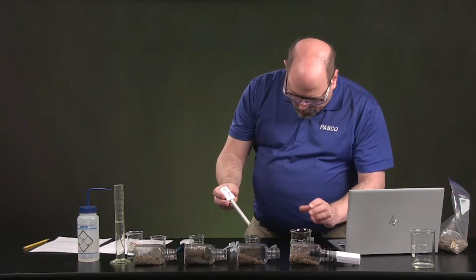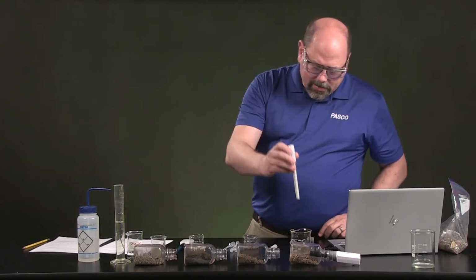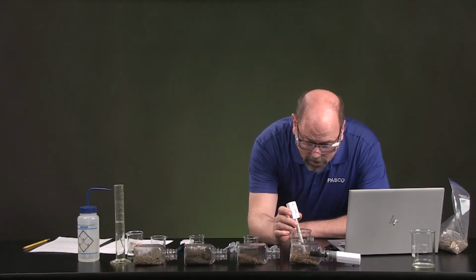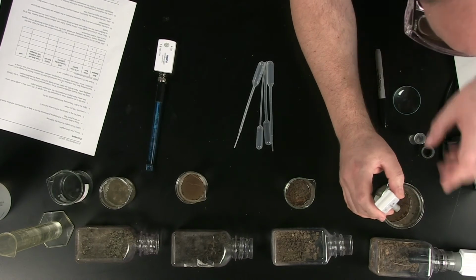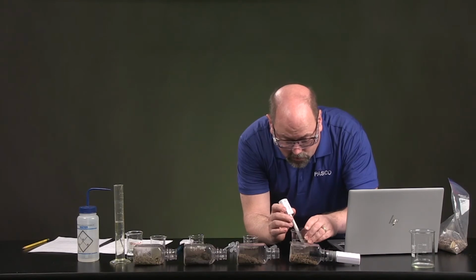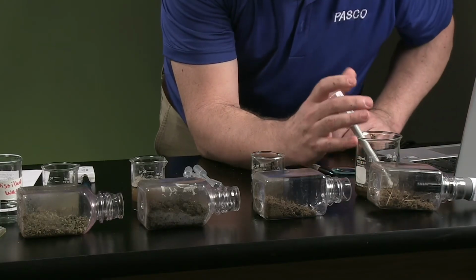But the best you can do is hope to get these to settle as much as possible as opposed to letting these sit down into the soil. You're going to want to put these in the water column, so just sort of at the surface. As a matter of fact, if you have a bigger beaker, I can get the sediments to go one side and then I can put the sensor on the other side.